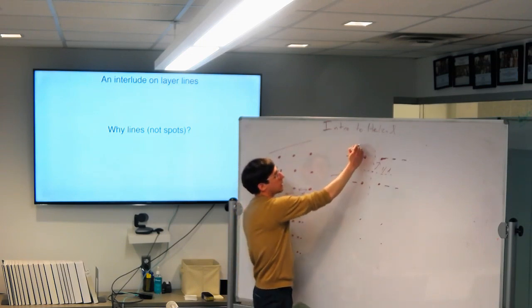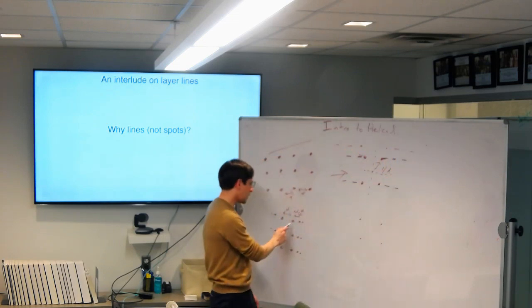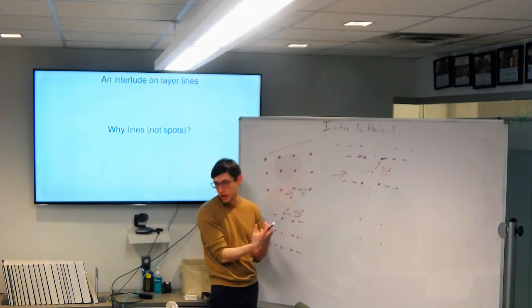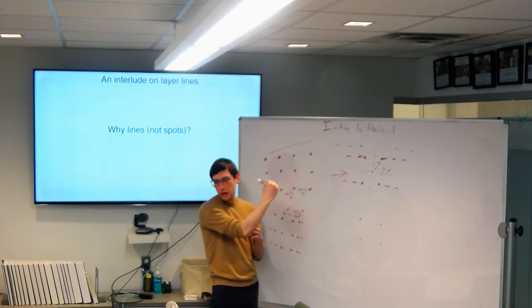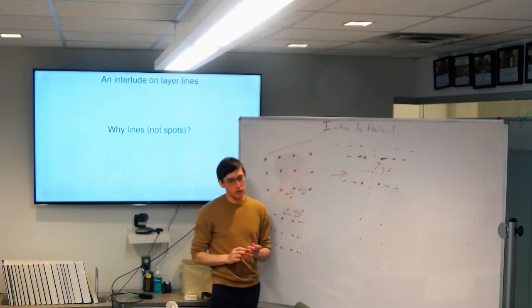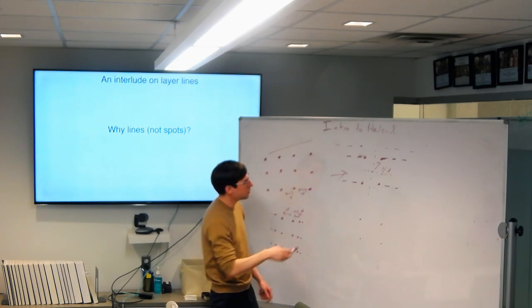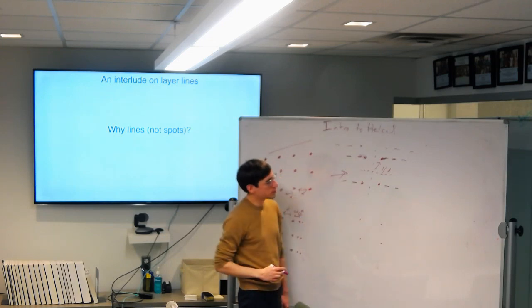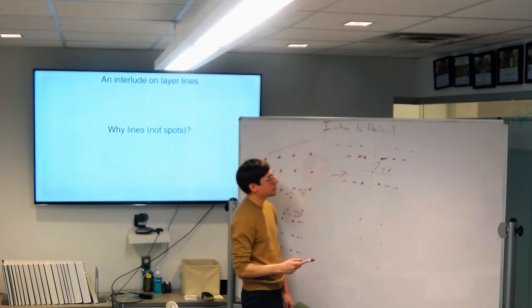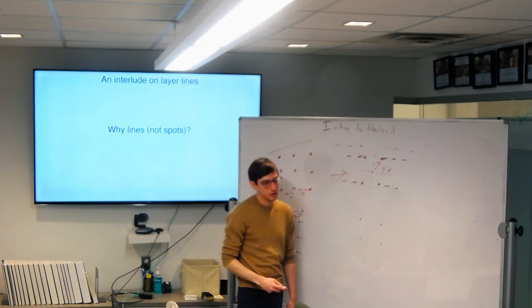The reason you get multiple sets of lines, briefly, before we go on, is because we're not actually looking at point sources in our EM images. We're looking at macromolecules. Those macromolecules have internal features, and you can see those features at higher and higher resolution if you slice them up into finer and finer pieces. So this is a lot like 3D crystallography, where you get different Miller indices with finer and finer slicing. In Fourier space, these will be spaced with integer slicing spacing of the actual repeat distance of your subunits in your lattice. The main thing I want you to take away is that you want lots of lines. The more lines you have, the higher resolution your image is, the better it is for 3D processing.